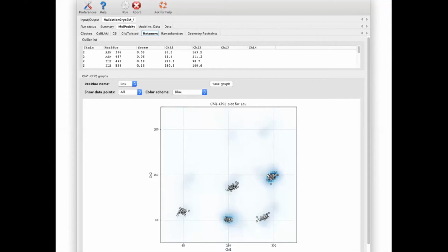And those are very much worth running before you refine with restraints on the rotamers. Although actually in that case, it doesn't matter that much because there's a small finite list of rotamers to look at. And so you can actually combinatorially look at them for rotamers, which you can't really do very well for Ramachandran.